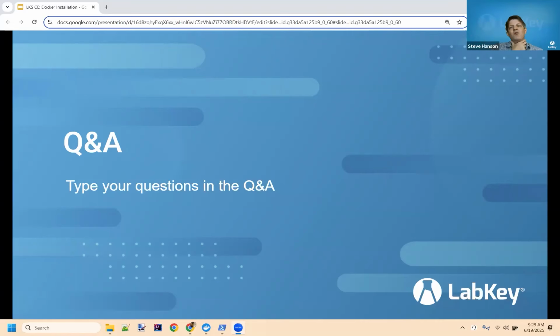Honestly, we don't have that right now. We do have a history though of that community forum, which you're welcome to search right now. But right now, that has been deactivated for continued use in the future. But there is again a rich history of documentation and of forum questions.